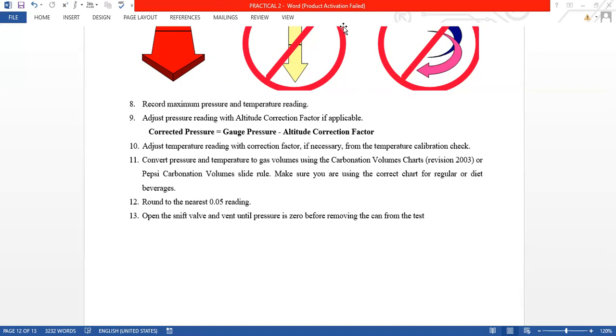That was all for the calculation of the free carbon dioxide from the given sample of the cold drink or soft drink. That was all from my side, in which I have discussed the traditional method and the current or the latest method.